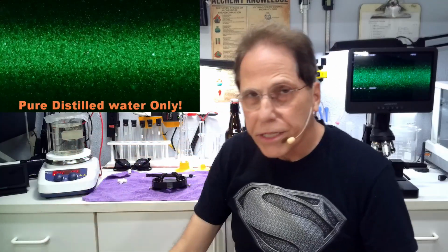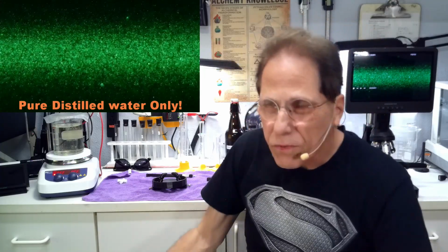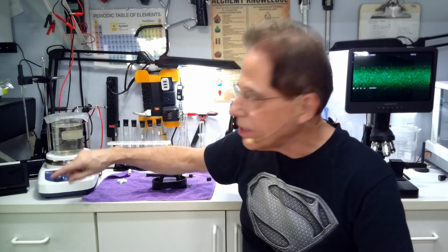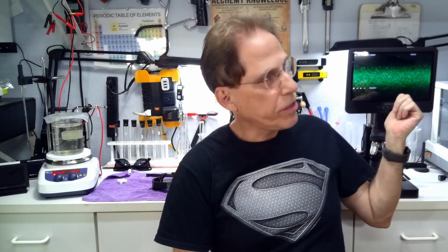Now the 1.5 milligram material that I cooked in 30 minutes was clear. So platinum definitely has a color to it. And I have no doubt that if I cooked it further, it might get a little bit darker than that. But that is a 6 parts per million solution there, which is a particle concentration equivalent to 24 parts per million silver.